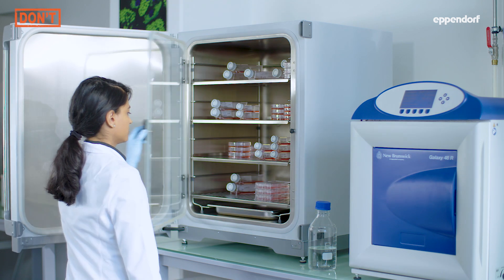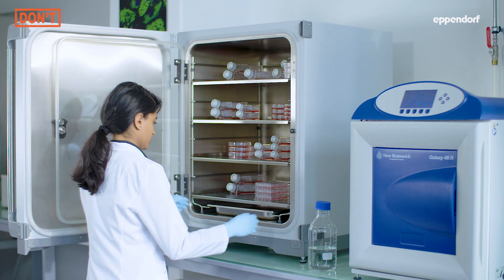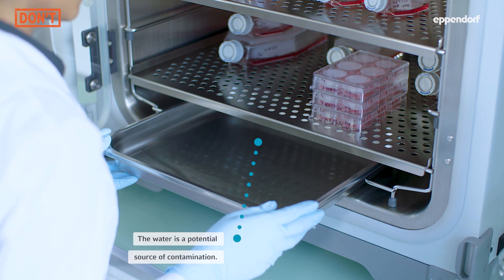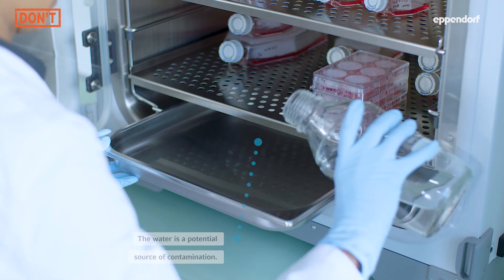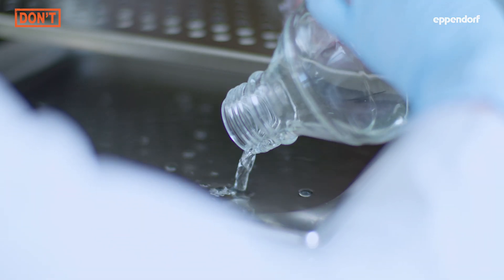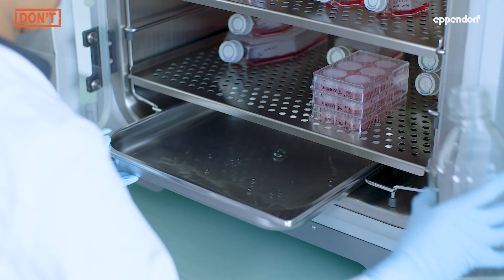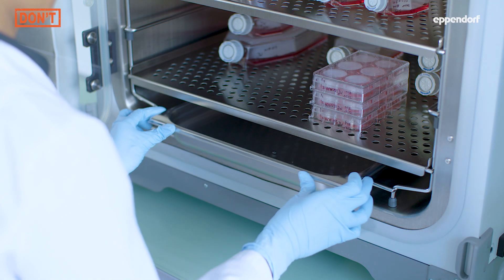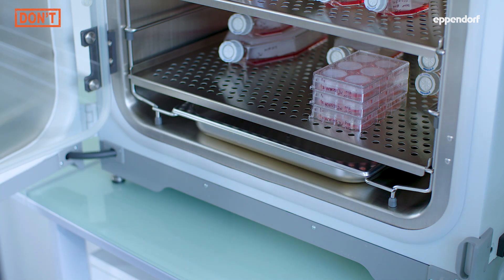A water reservoir inside your CO2 incubator ensures a humid atmosphere and reduces evaporation of media from your cultures. But a water reservoir can also become a source of contamination if it is not refilled properly. Simply refilling the water reservoir preserves contaminants within and can lead to the spread of contamination to your cultures.